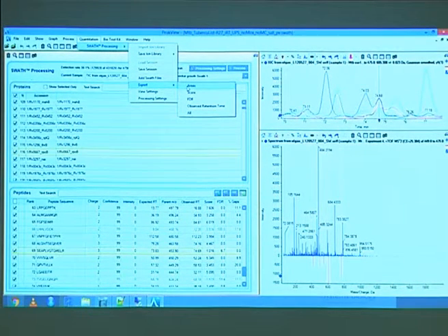And then for the protein, it sums all the peptides up, even this one protein that was only found once, not the second time. So there is some, well, you can discuss if you really want to include that or not. I prefer looking at peptides that are identified everywhere.